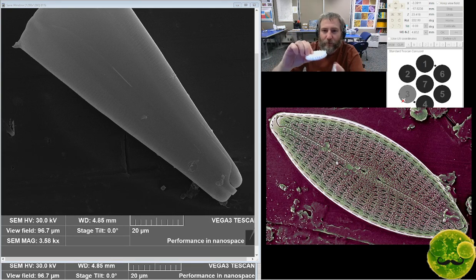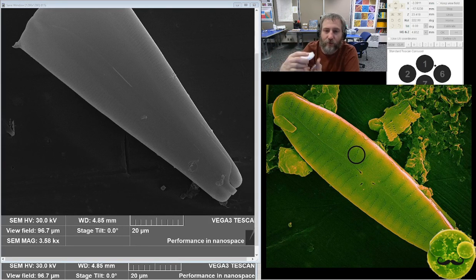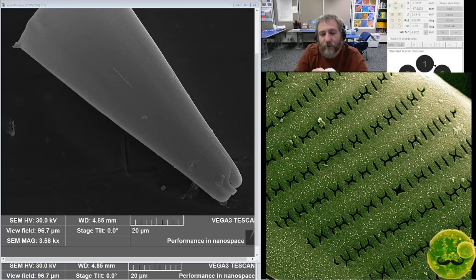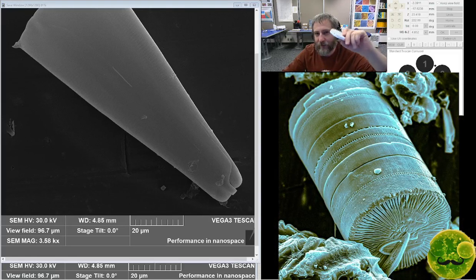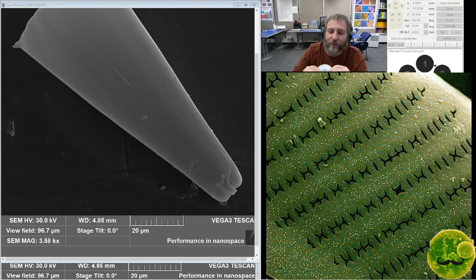But we took pictures from all different angles around this diatom, and then we put it into a 3D modeling program that interpolates the distance to objects based on the photographs, or photogrammetry, and we created a three-dimensional object from that, and then we could print it on a 3D printer. So that's pretty cool. It takes a lot longer. To get this model, I took 75 photos, and it was actually only half of it, right? We only did half because we could only see half of a diatom at a time. Then we did some clever cropping and glued the two pieces together, and I pull them apart occasionally because they're just stick glued together.